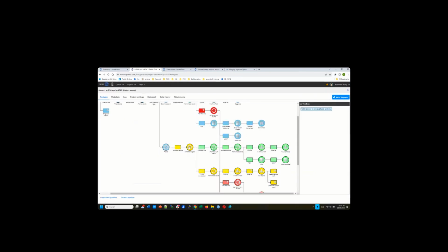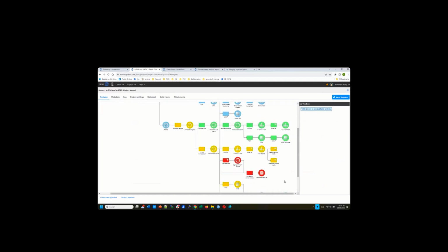The other way is just to look at the peaks. I just want to analyze the peak coverage. I don't want to aggregate all the peaks in any other format, but I annotate the peaks. I know the peak location. We might have peaks in intronic regions, etc.